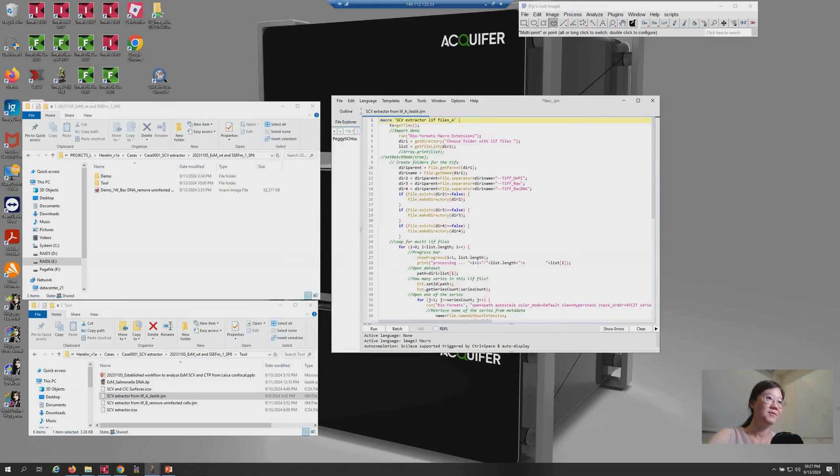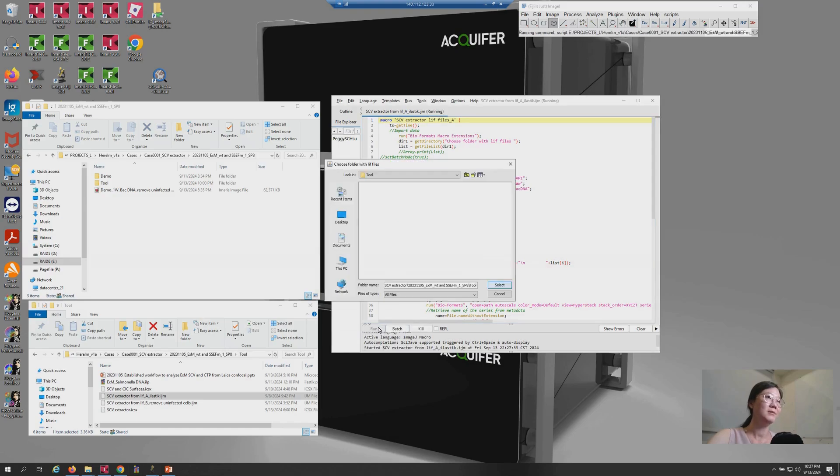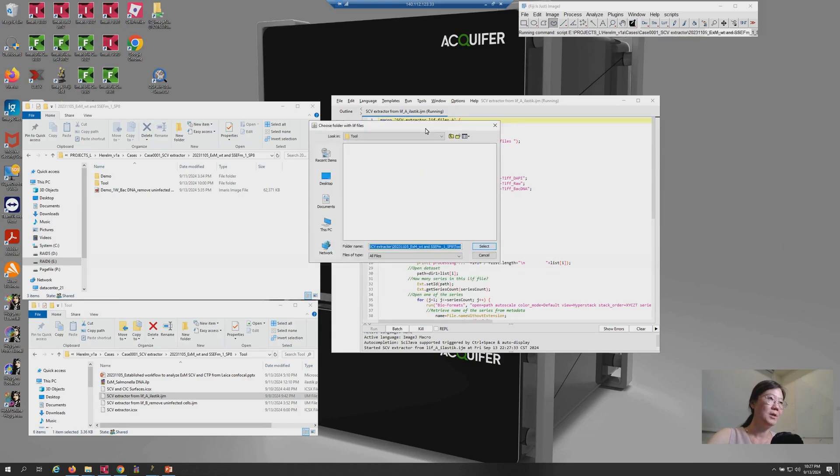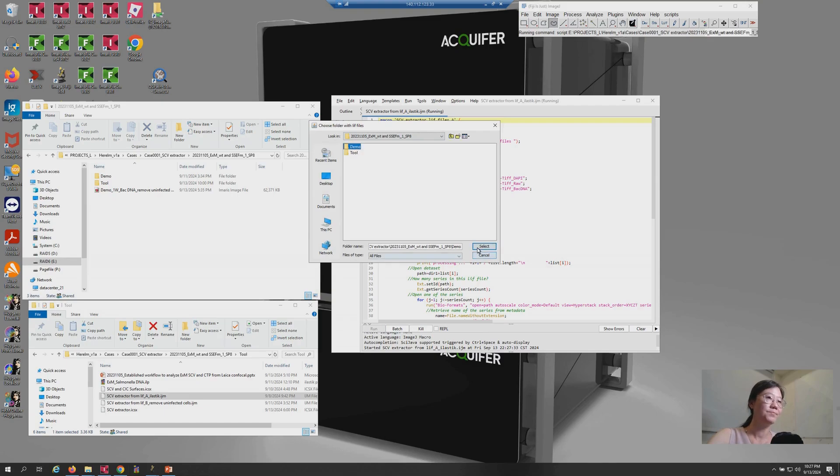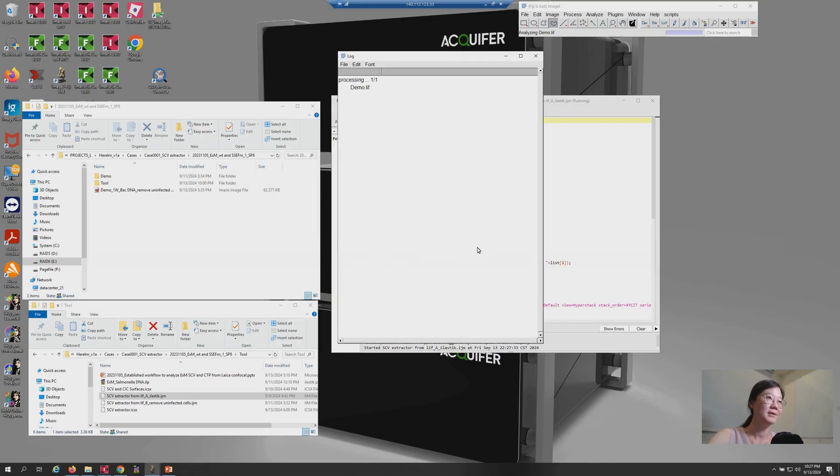Then, it's very simple. Just click Run. Now the script will ask for the folder where the demo image locates. Choose the folder named demo and select.